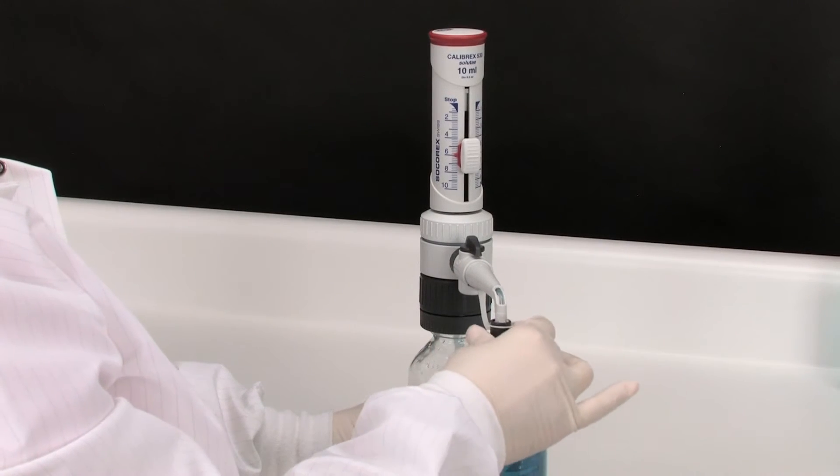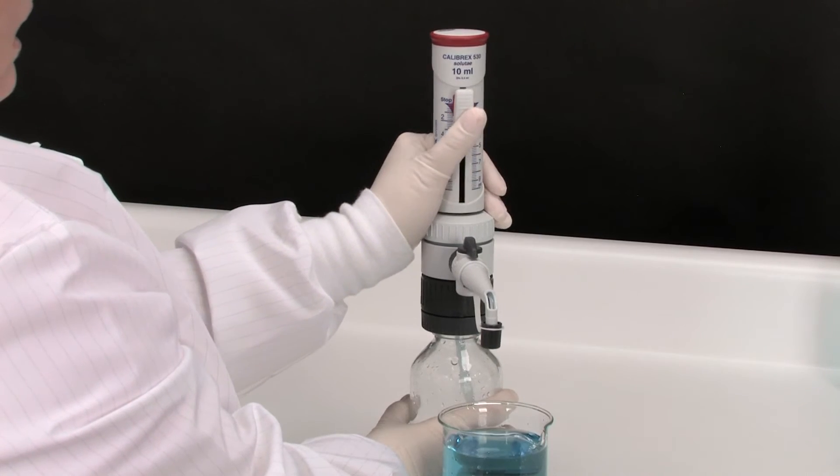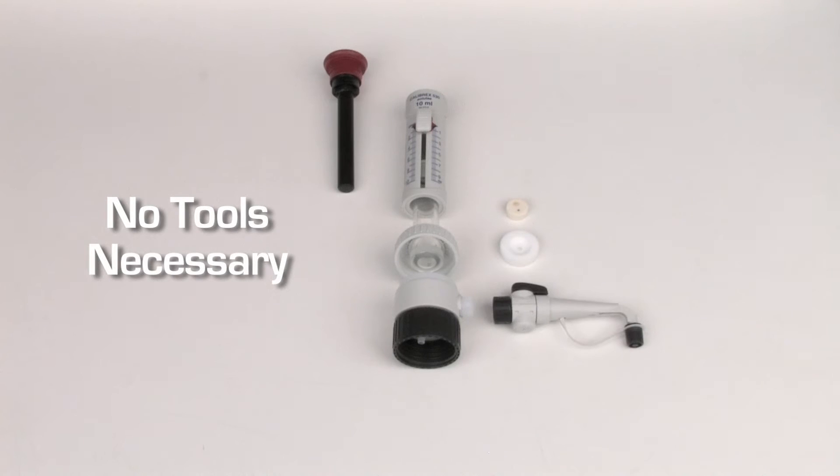Reattach the screw stopper when dispensing is completed. Additional safety is provided by a range of locking positions. The dispenser is made of only a few parts, making it easy to disassemble, clean and reassemble, with no tools required.